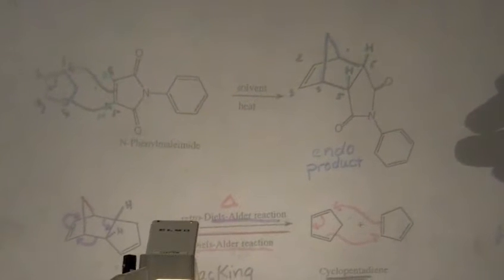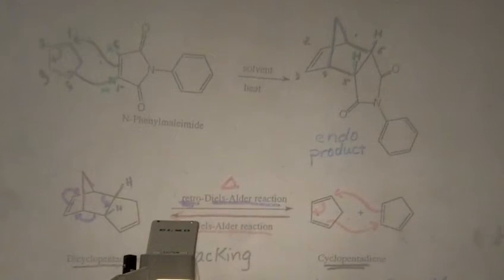And then again, here we've got our endo product, okay? And so when you're talking endo, it gets a little bit confusing what you're talking about, but you're looking at it being syn relative to your largest bridge, and in this reaction, this is our largest bridge, versus it being the other direction, which would be exo. So if we move this guy up, we would have the exo product, which isn't formed, okay? And so, like I said, this reaction is really fast. We have you reflux it for 10 minutes, but you don't really even need the reflux to get it to go. It goes instantaneously, okay?